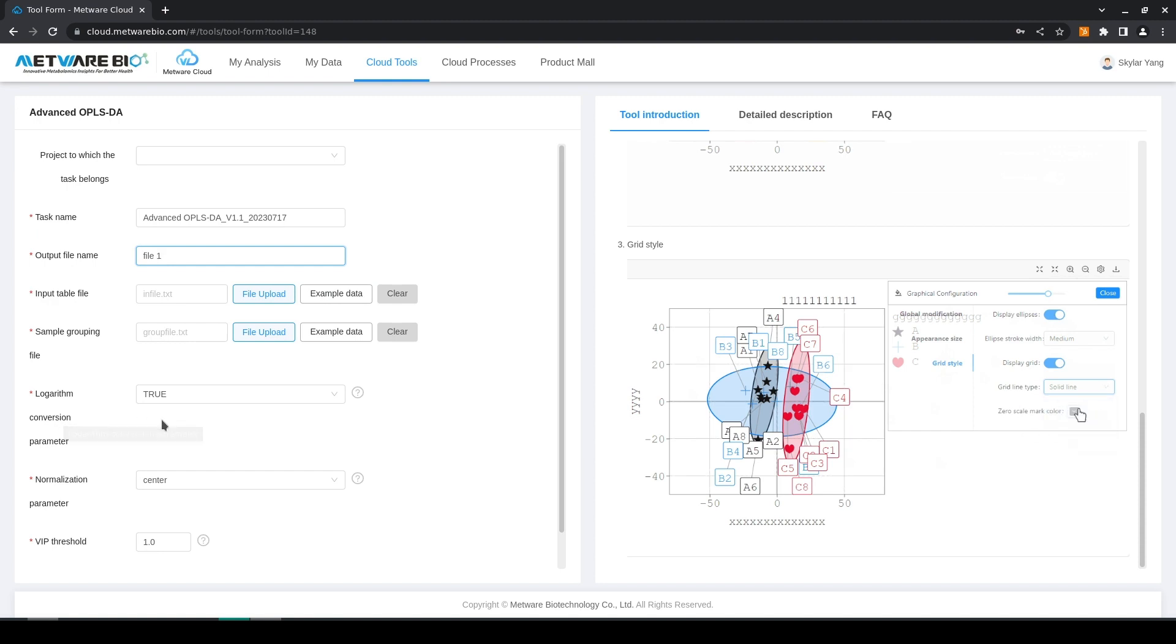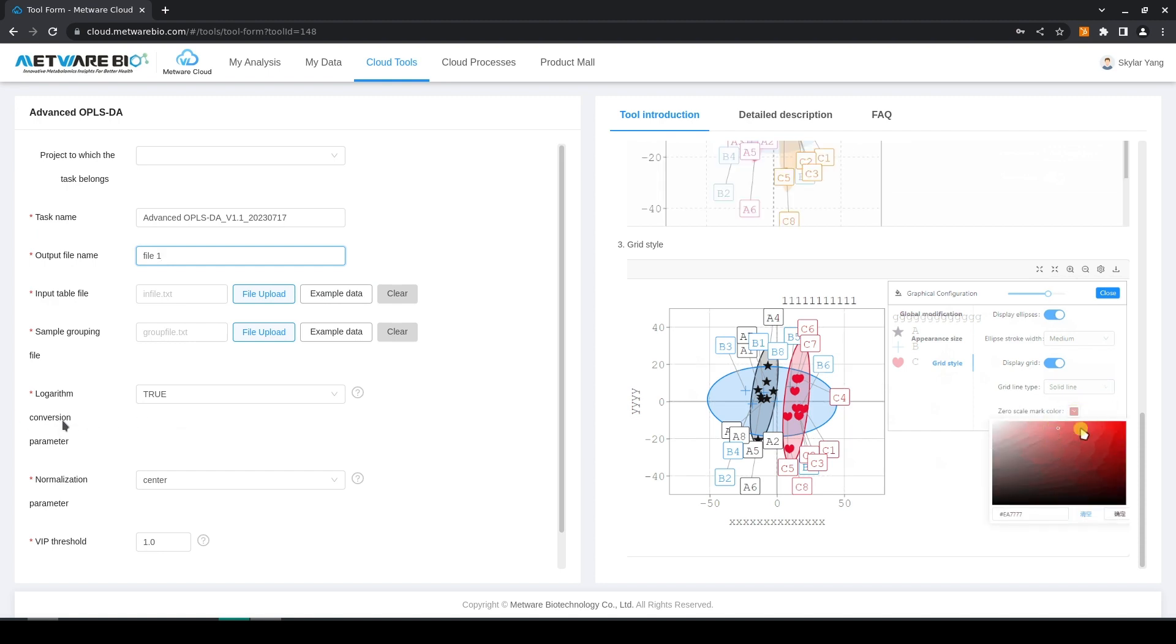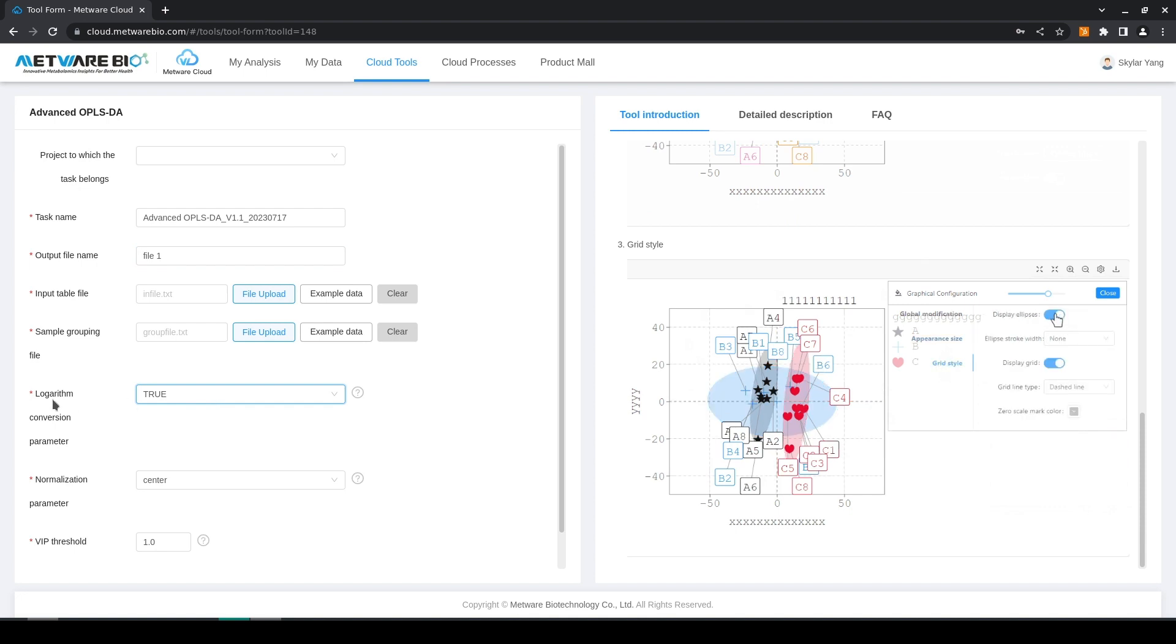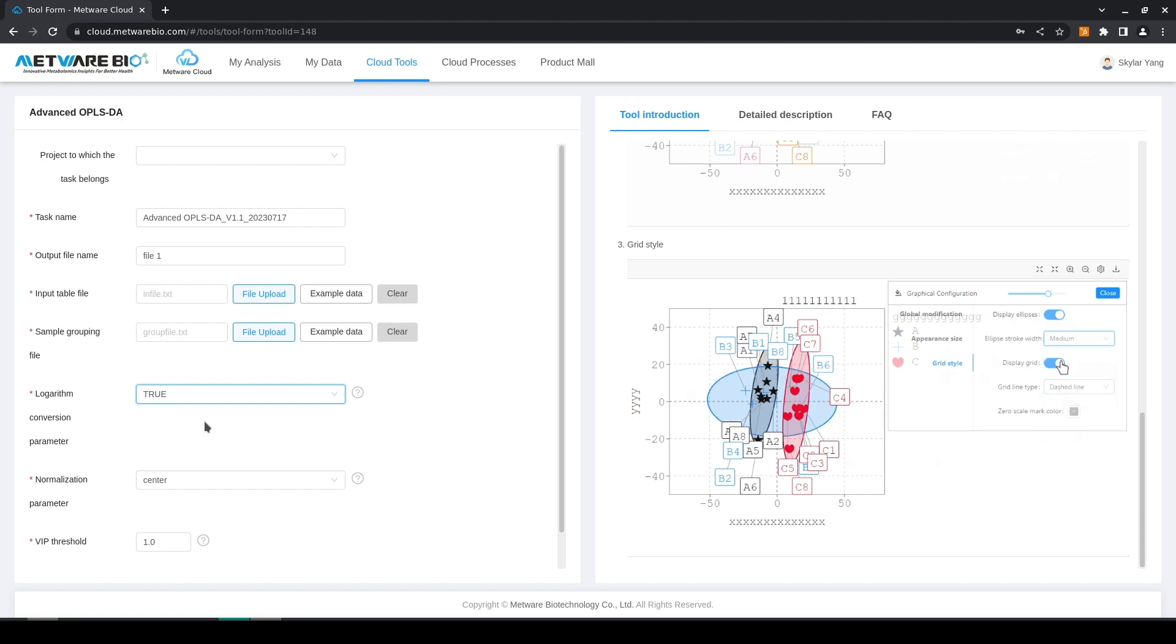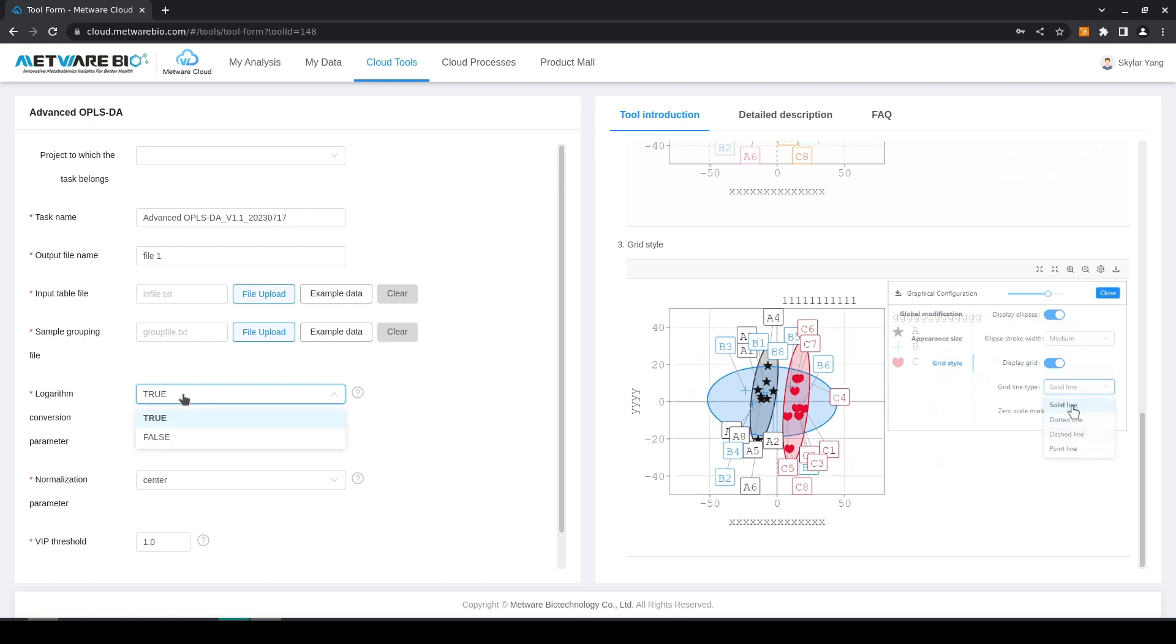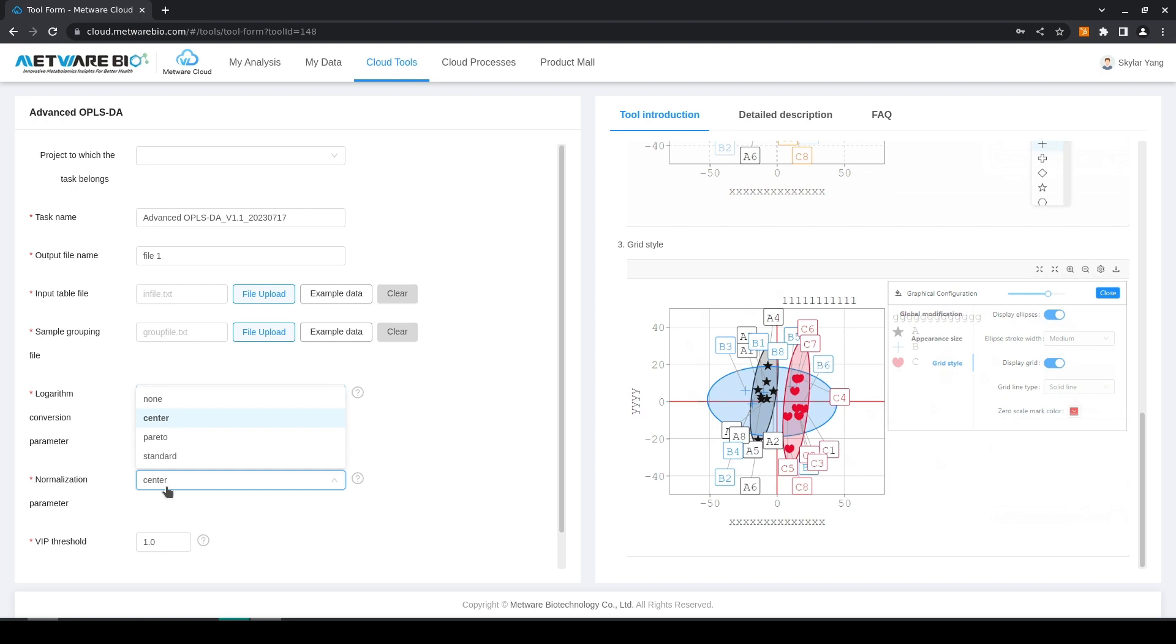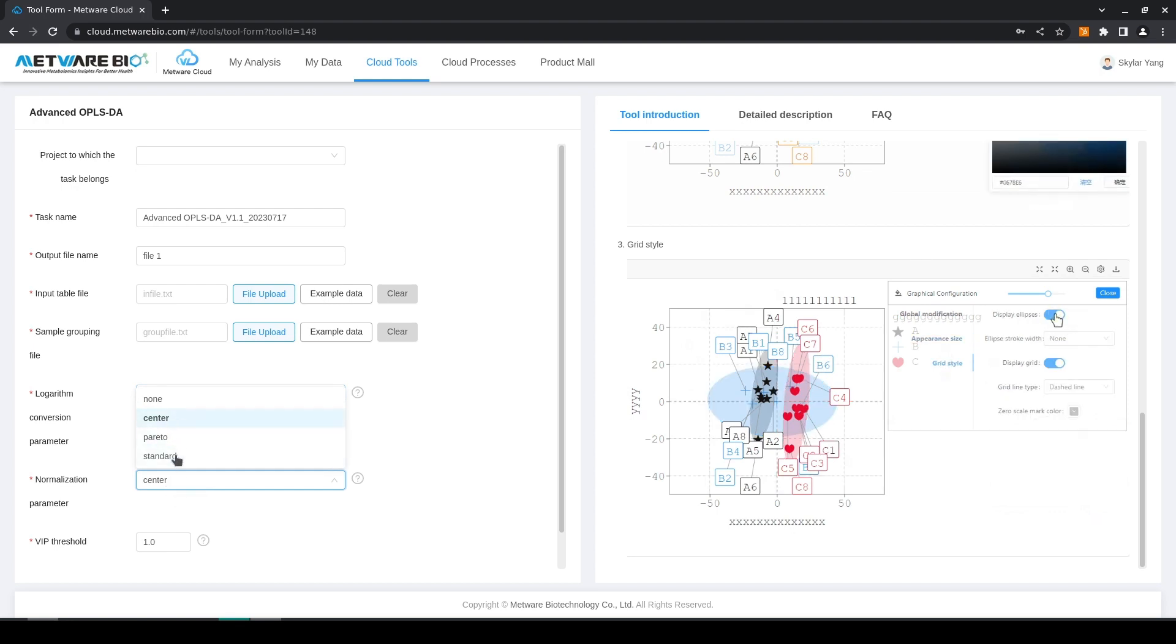Here is the logarithm conversion parameter which can be set either true or false. It simply determines whether you want your entry values to be converted into the base 2 logarithm value or if you just want to use them as is. Here we have the normalization parameter where you can select a number of options or just leave it at none.